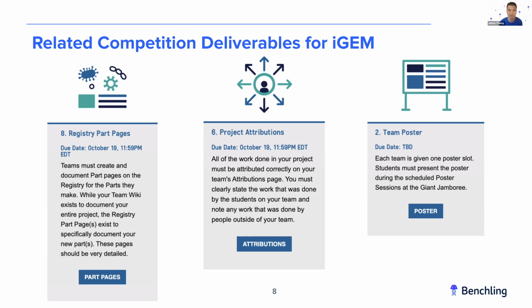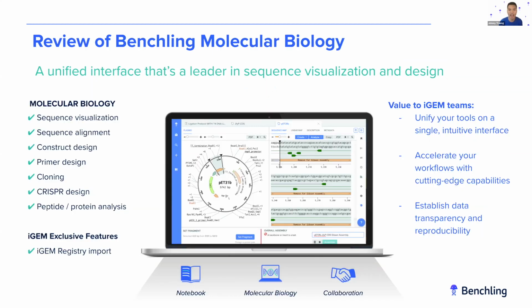And with that, of course, before we get into the demo, I want to give you all a quick review of the Benchling Molecular Biology platform. It's one of our 2 major applications that we offer. Our molecular biology suite is really a unified interface that's a leader in sequence visualization and design.